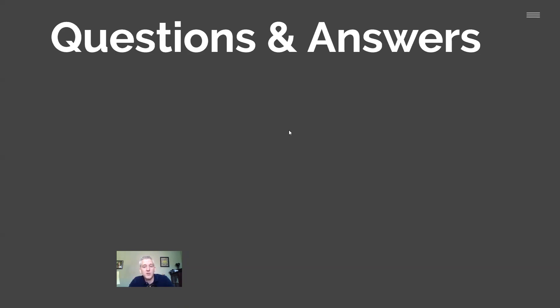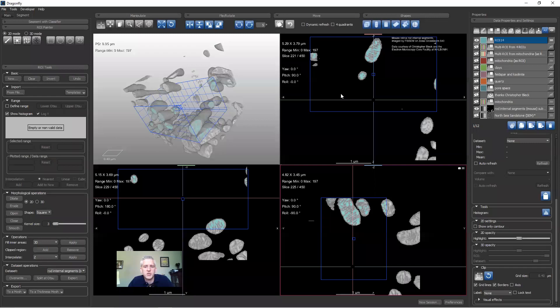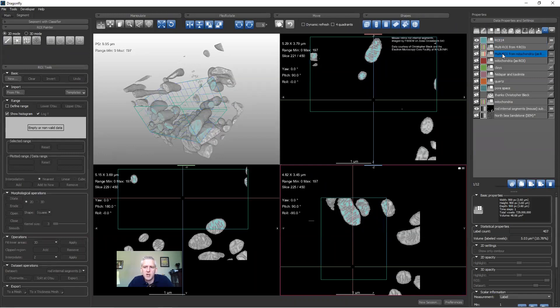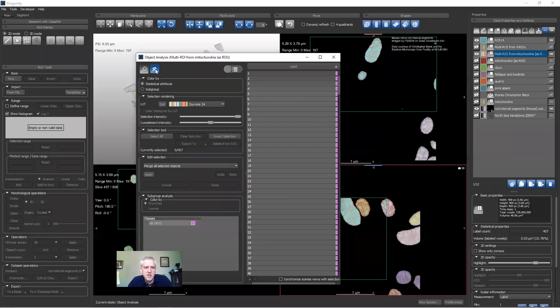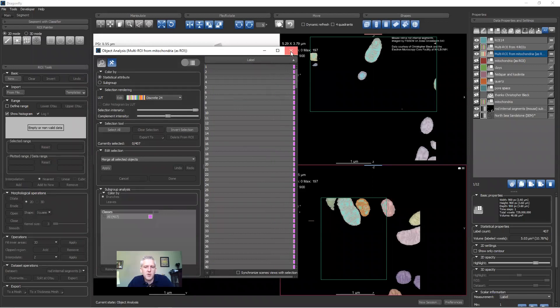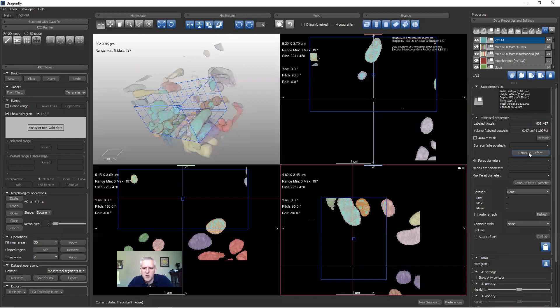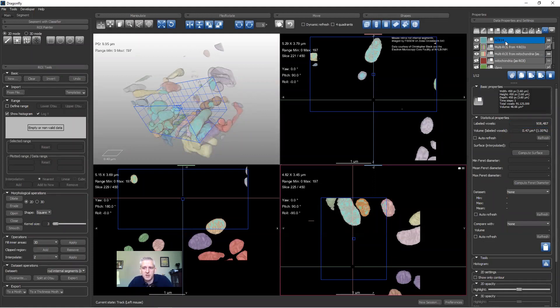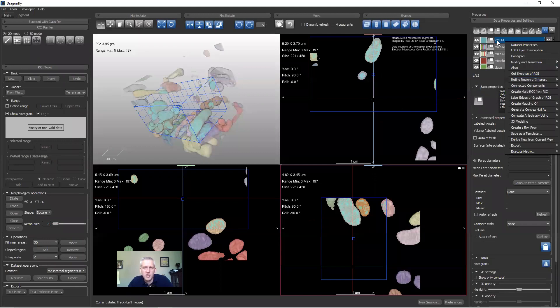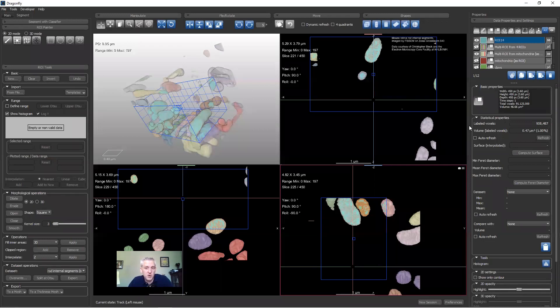How do you analyze a single ROI to view surface area, volume, etc., like an objects analysis for a multi-ROI? If you select a multi-ROI, right-click, and go to Analysis, you can make all those measurements. For a single ROI that is not a multi-ROI, you can view the properties panel to compute surface area and see volume. You don't have the full suite of other measurements on a single ROI. However, if you need those measurements, you can right-click and create a multi-ROI from the ROI — even though it'll only have one material and one row in the table, you'll have access to all the measurements.